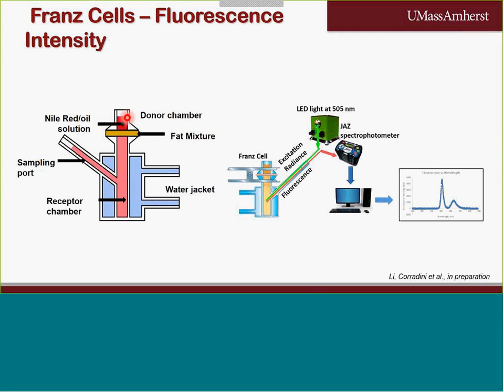It has, of course, its water jacket in order to perform the study at a constant temperature, and it has a sampling port. The sampling port we use in order to include a fiber optic that was to measure the signal of the diffusing probe, and corroborated that it was diffusing at the same rate as the compound of interest, a liquid oil, and we measure fluorescence along time.